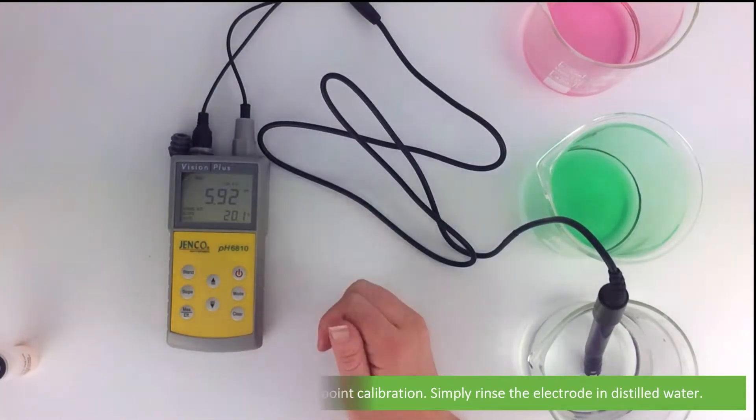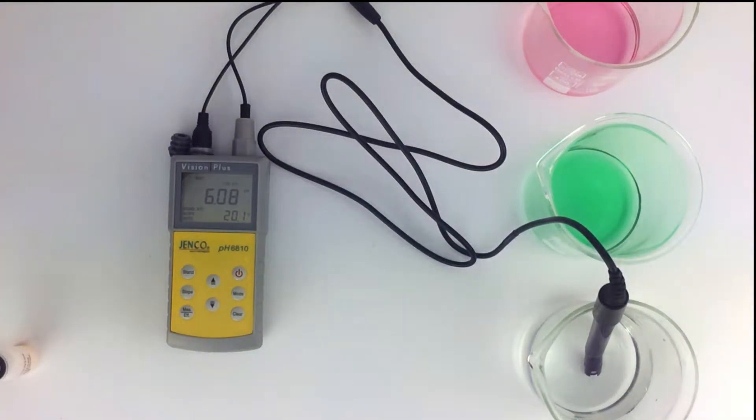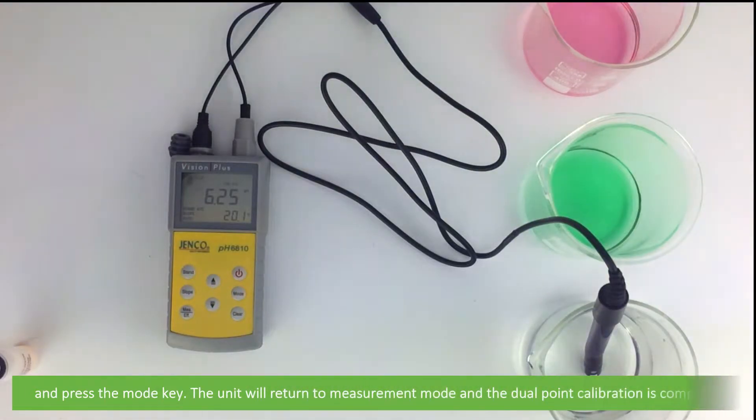Simply rinse the electrode in distilled water and press the mode key. The unit will return to measurement mode and the dual-point calibration is complete.